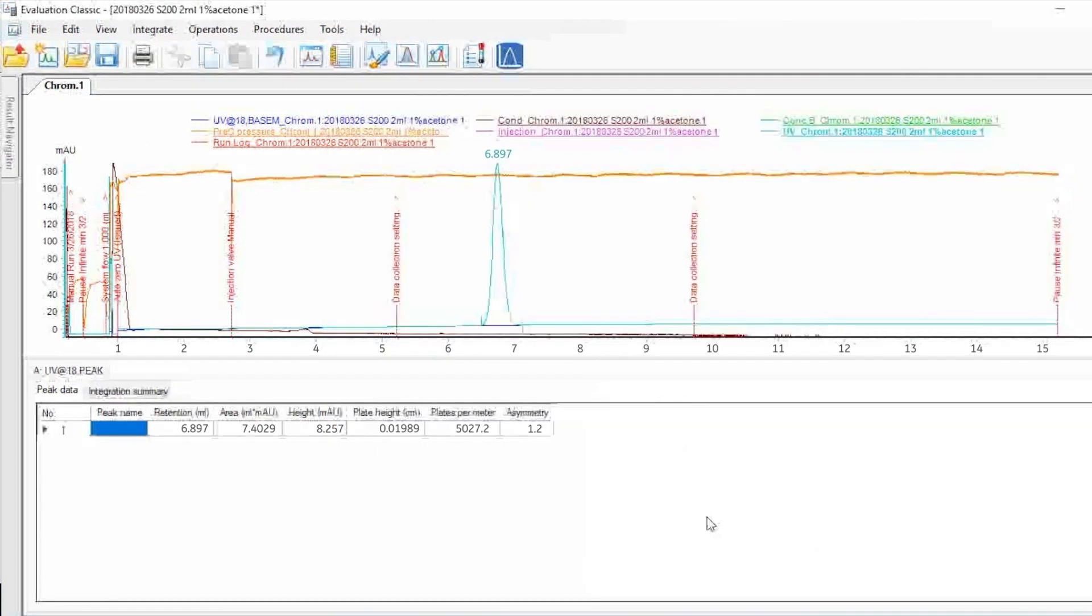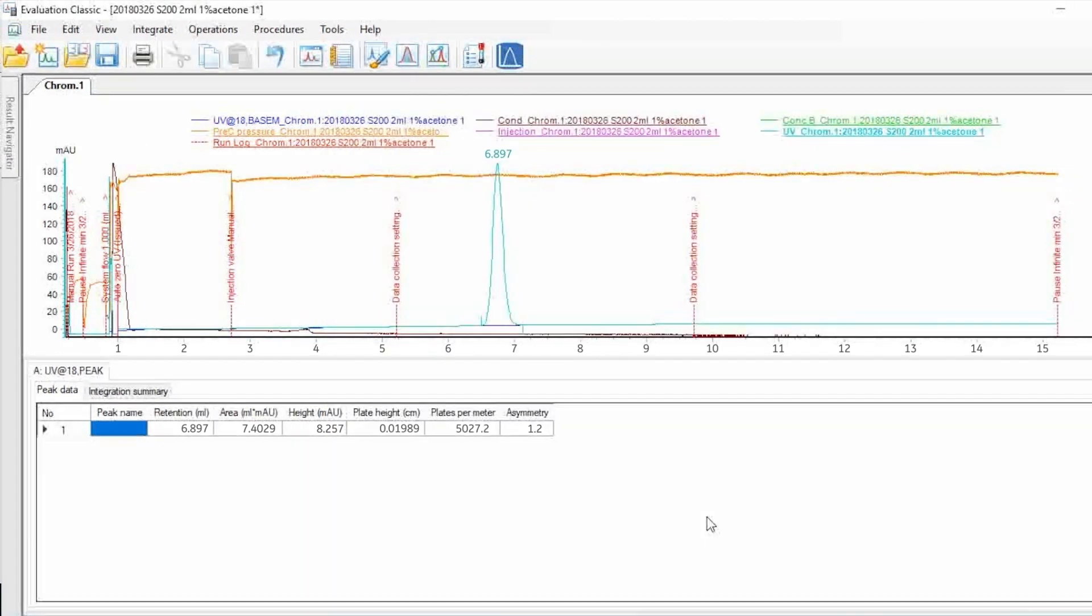The qualified HETP needs to meet requirements described in the user manual and asymmetry needs to be between 0.8 and 1.8. Based on these requirements, the performance test of this column is passed and column packing has been successfully performed.